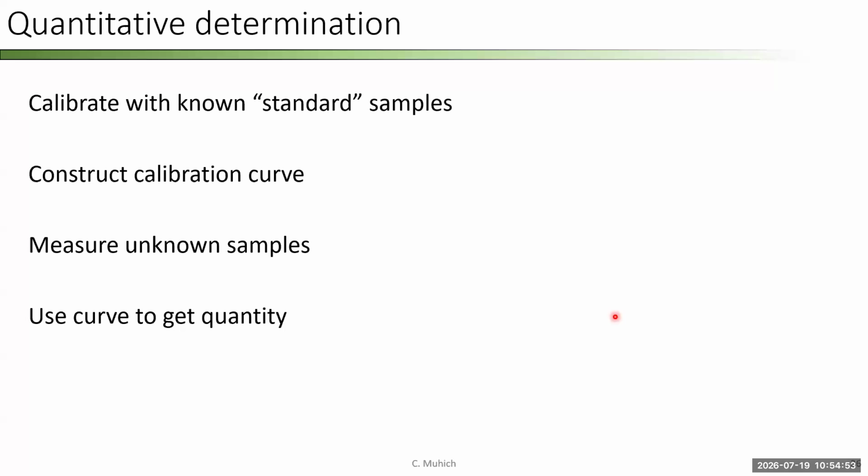Okay, so we've talked a lot about identification. We've touched on quantification. Just to reiterate this, through all of our different analytical techniques, what we do is we calibrate our instrument with known standards. So that means I very carefully measure out and make some standards that have 1%, 5%, 10% of the compound I'm looking at.